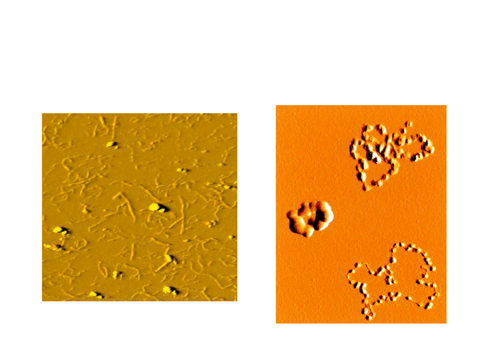For example, if you just relax your eyes for a second, this is DNA. This is the first photograph of DNA. Like, all you have ever seen before is some artist drawing what they think it's supposed to look like. And for a lot of biologists, this is really revolutionary because we can actually see it. And these are just some cool things.